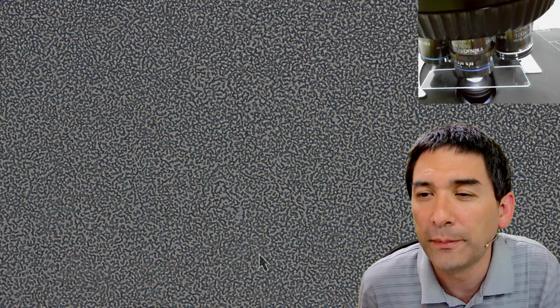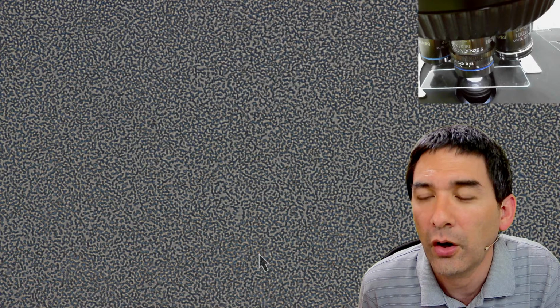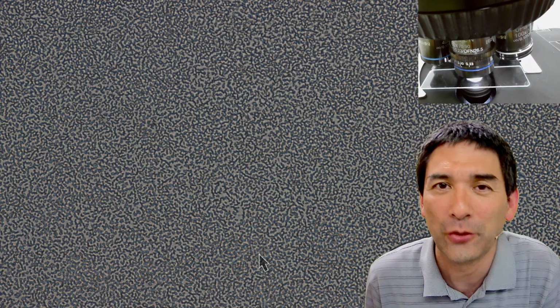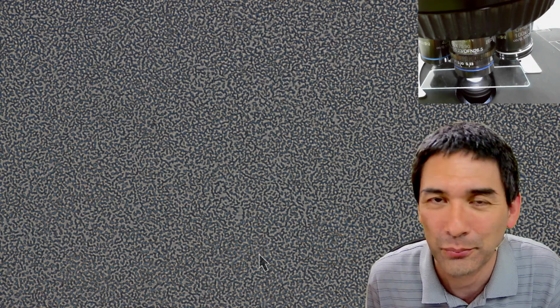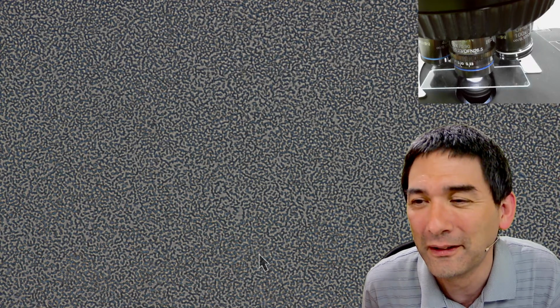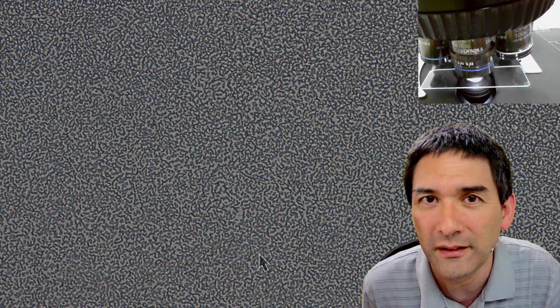I dropped the cover slip on my floor, and it took me over a week to find it. Just use a vacuum cleaner or some broom. Cover slips are not so expensive. But of course, if they break, then you might get injured.